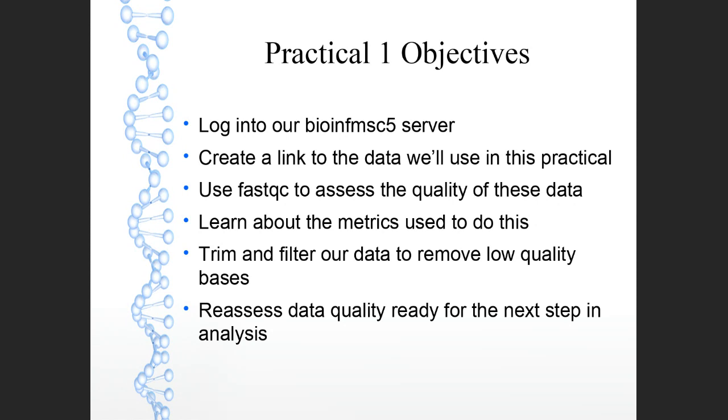We'll then use a tool called FastQC, Fast Quality Control, to assess the quality of these data files. We'll go through each metric that tool uses to assess the quality of our data. And then we'll do some trimming and filtering to improve the quality of our data before we might go on to use that data for further analysis. So this is a very important step.